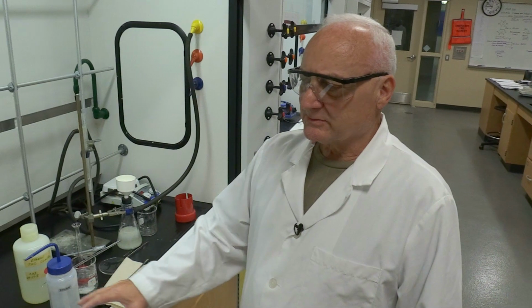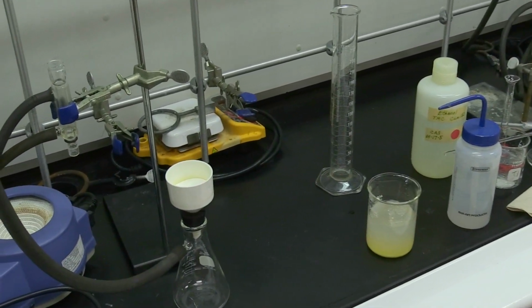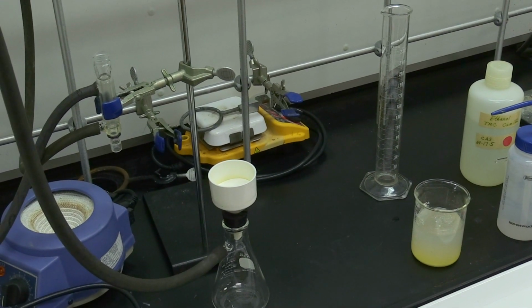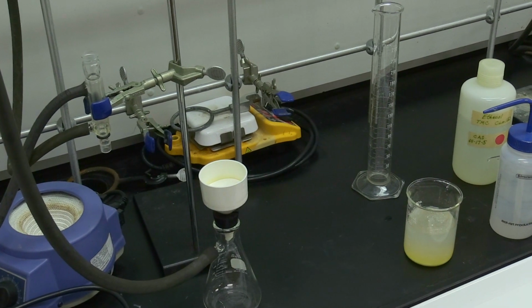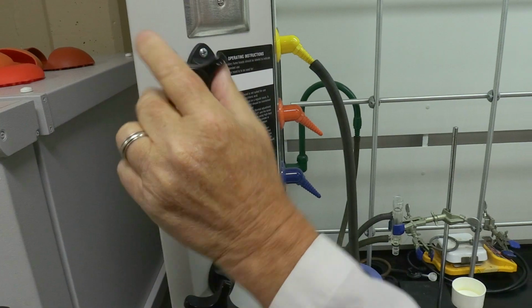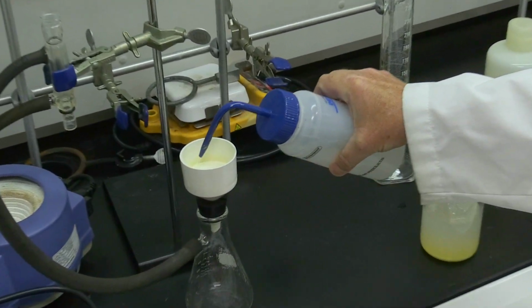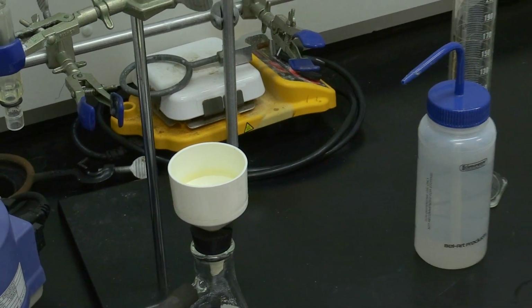Okay, now we're going to go back to part A. Filter the product with the liquid and let it suction filter for several minutes to help dry it. So we want to always start off with a wet filter paper. We let this solution sit for a little bit.